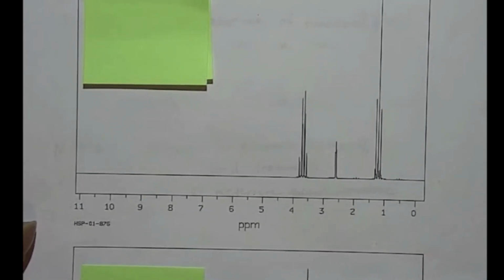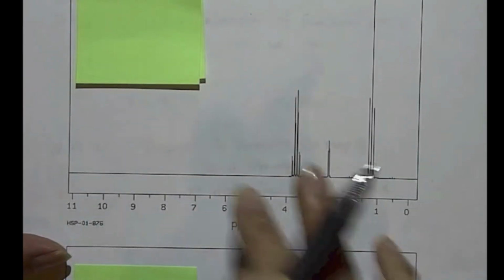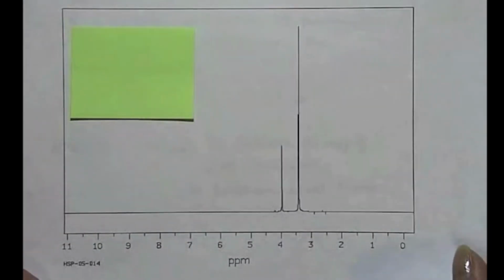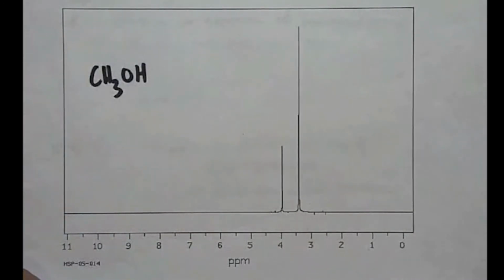Notice that they're drastically different. Because NMR allows you to take a spectrum and interpret the carbon-hydrogen framework, and because I know how to do that, I know that this spectrum comes from ethanol, and this simpler one is the spectrum of methanol.